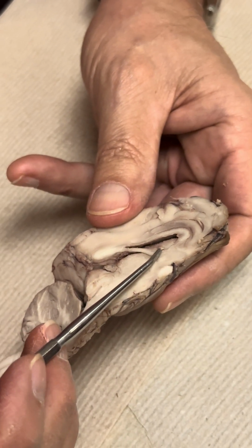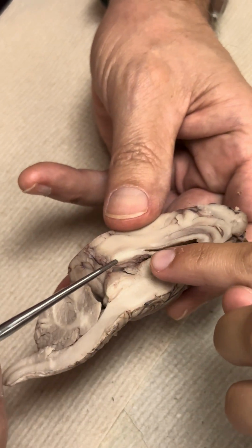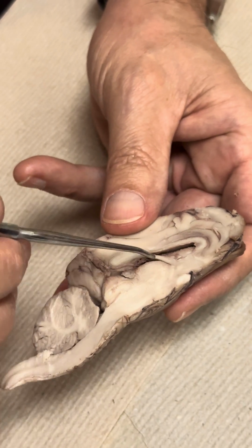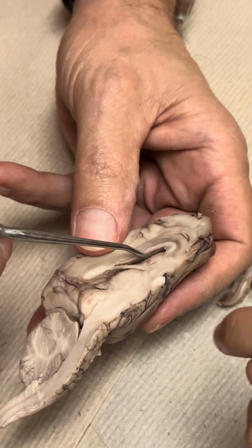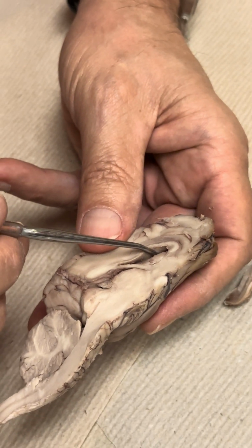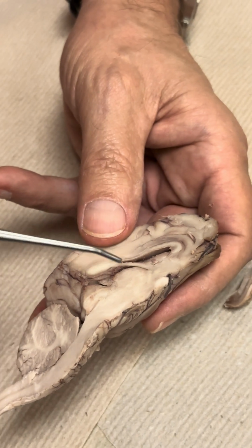The fornix actually goes to the hypothalamus. So this is the lateral ventricle, and then this is the third ventricle. This space is the third ventricle. But this opening right here is the lateral ventricle. We have two laterals. We only have one third and one fourth, but we have two laterals.